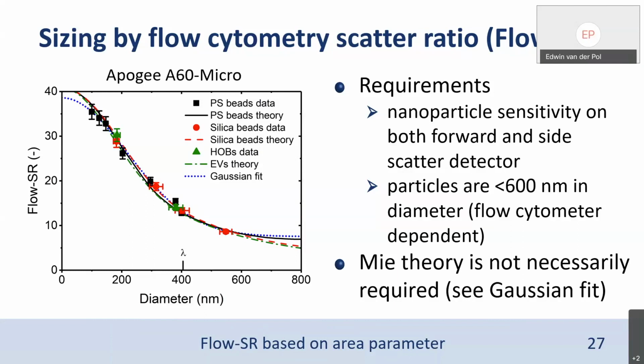So I don't know. I'm not aware of the neutral density filter trick. It seems to me if you place a neutral density filter in front of a scatter detector, you're attenuating both the signal and the noise. So generally, it's not something I think which is really handy to do. But I may be wrong, so please send me the paper. I can check what I think.